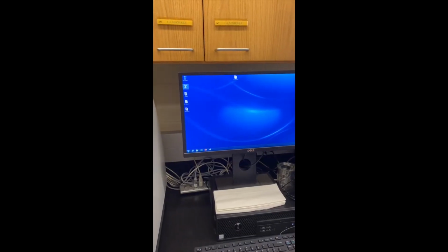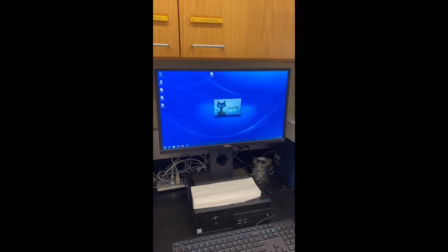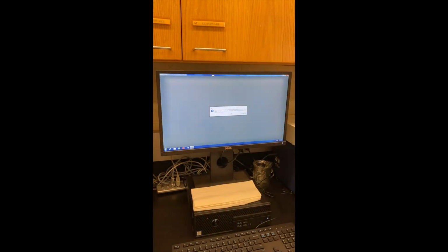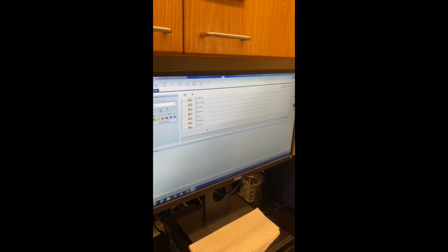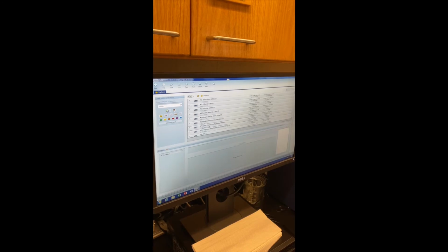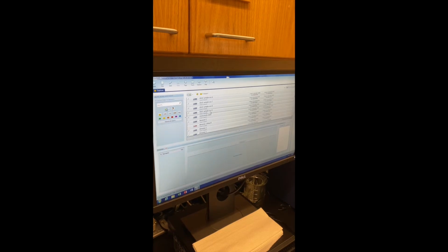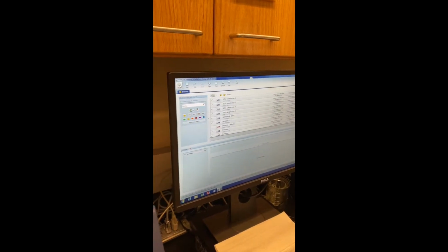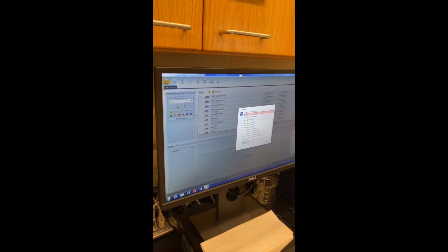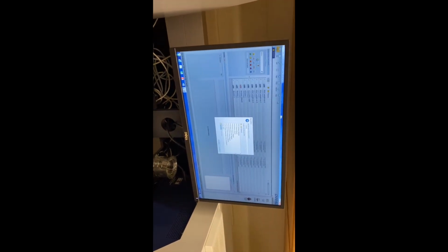Software we're using is the Vision Cats. Double click and open it. Usually you go to whatever folder you are using. So I have a folder and I already have a method. But I will create a new method. This is for the training. So you click new and a new method. I'm gonna name it training.